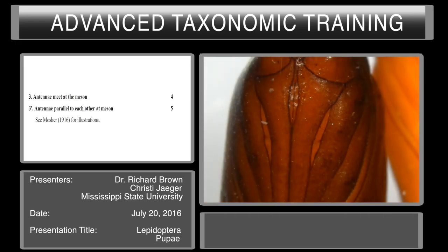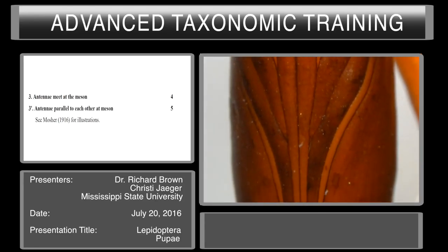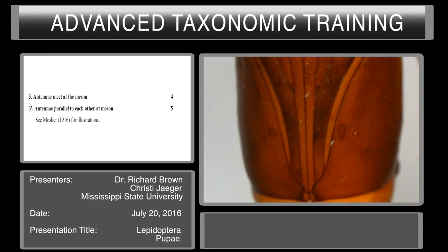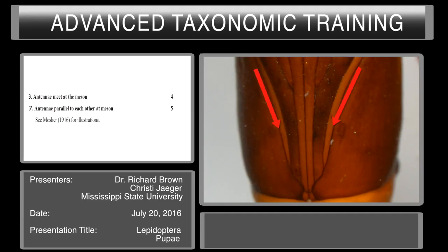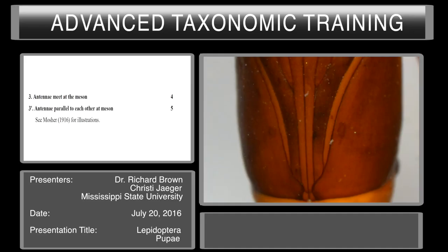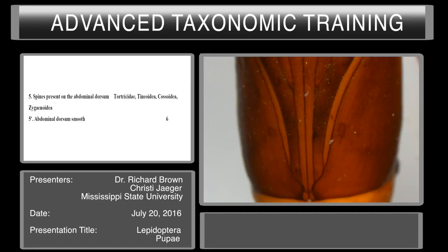Couplet three: antenna meet at the meson, or antenna parallel to each other at the meson. The antennae are on the sides beside the mesothoracic legs — they're the lighter areas here — and we can see that they don't meet at the meson, however they are parallel to each other. So we go to couplet five. These characters can also be seen in Mosher's 1916 publication for more information.